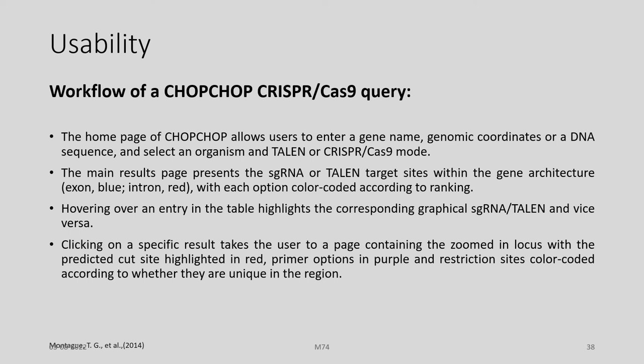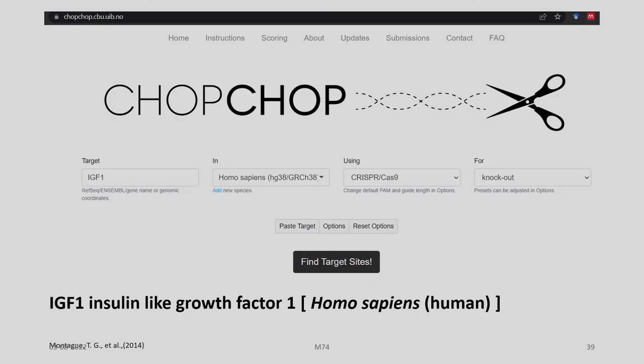Hovering over an entry in the table highlights the corresponding graphical single guide RNA or TALEN and vice versa. Clicking on a specific result takes the user to a page containing the zoomed-in locus with the predicted cut site highlighted in red, primer options in purple, and restriction sites color coded according to whether they are unique in the region.